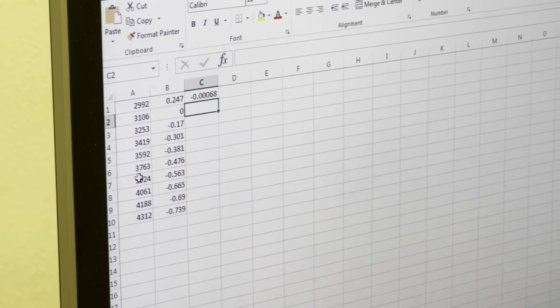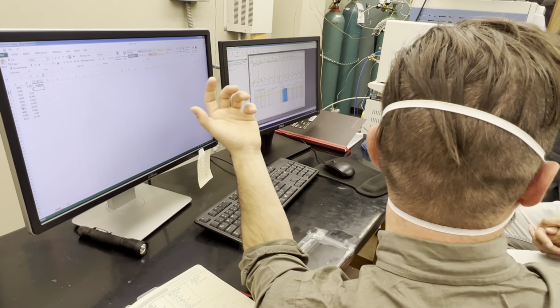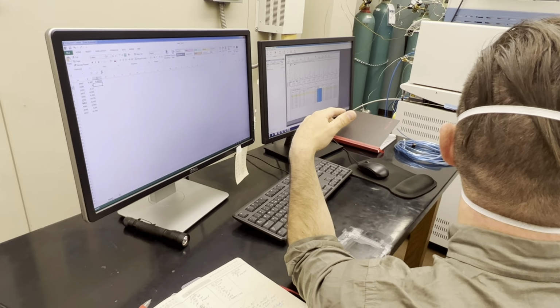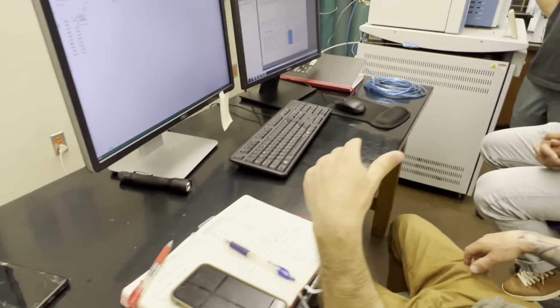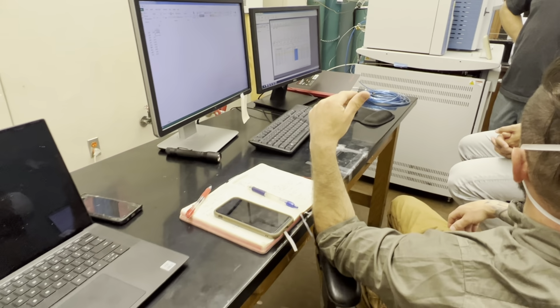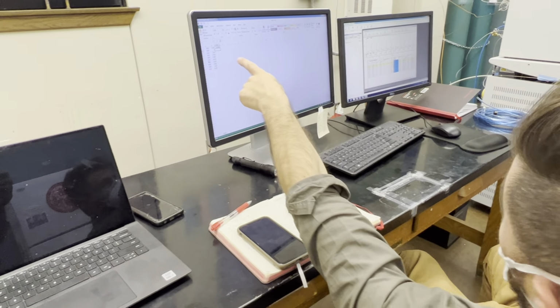Now the slope's in per mil, so it should be times 10 to the negative 5. I think 6.6 times 10 to the negative 5 would be the limit. Anything greater than that has not passed spec. If you look in the manual, it'll say 0.066, but it's 0.066 per mil. So you have to take those extra zeros into account.